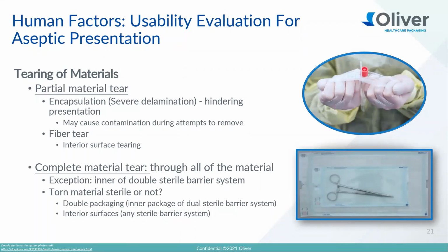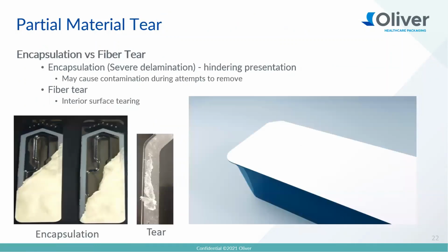Yes, and let's start with partial material tear and comparing fiber tear versus encapsulation. So Tommy, let's talk about partial tearing in more detail, in particular encapsulation and fiber tear. Encapsulation could be just severe delamination of one form or another in different types of materials.